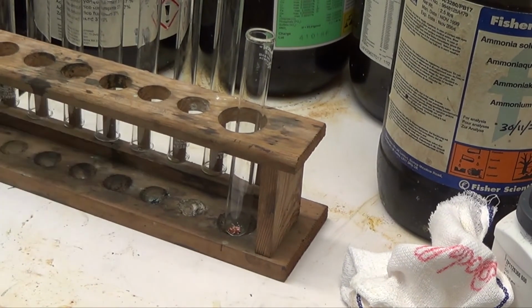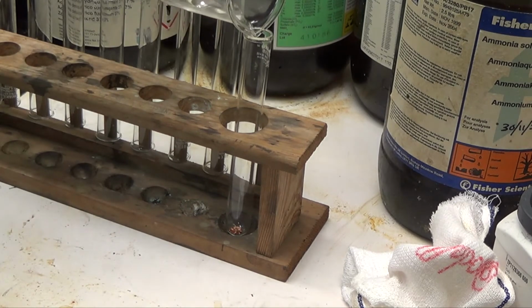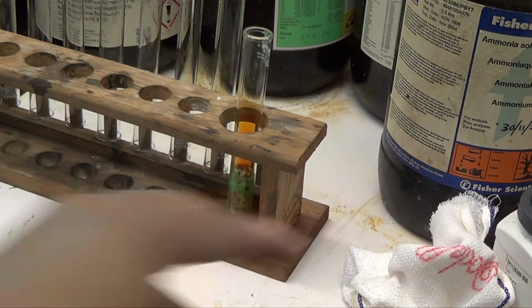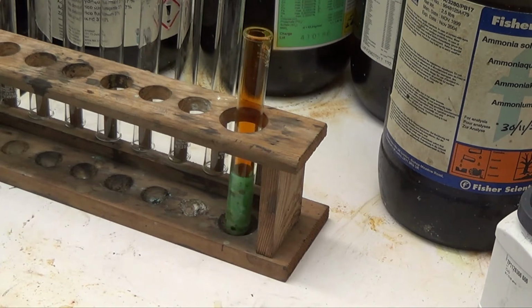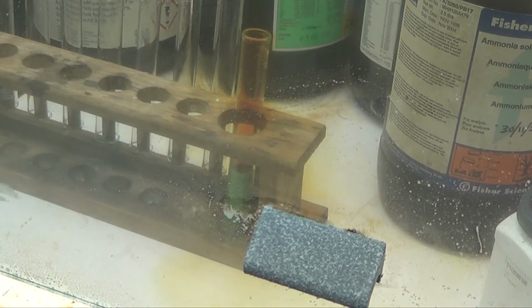So I'll add some concentrated nitric acid to this. And I hope you'll see that there's a bit of brown gas given off. I should lower the fume hood. So the brown gas is NO2 being given off. Okay, and the green solution is a result of transition metal chemistry involving copper 2+ and some other things in the solution.